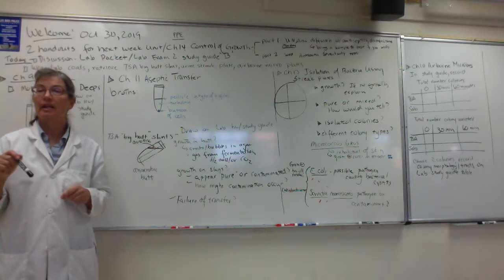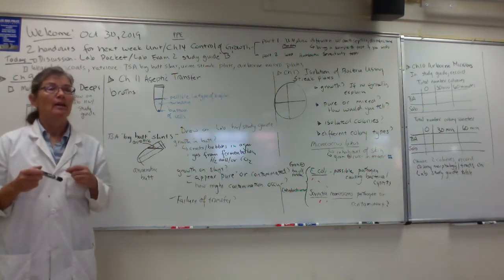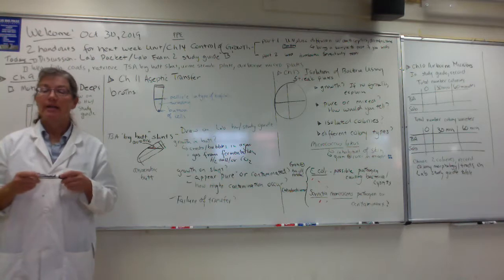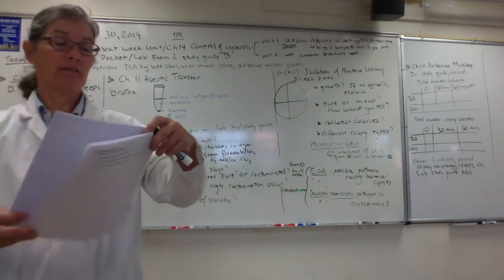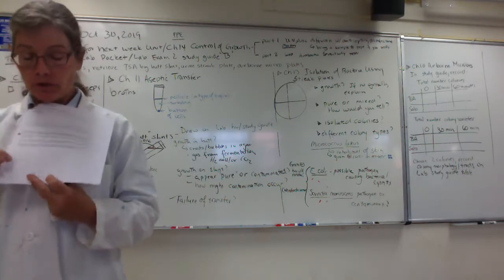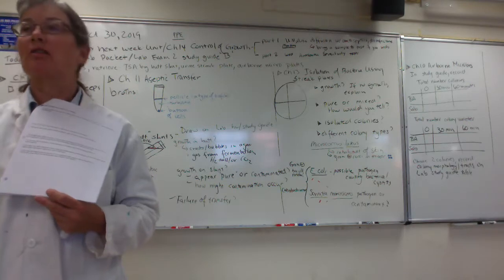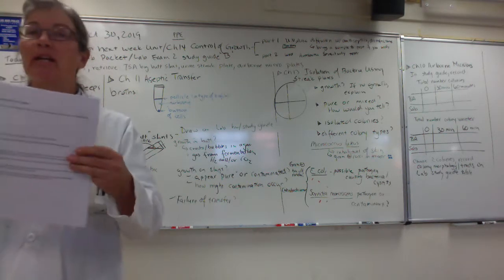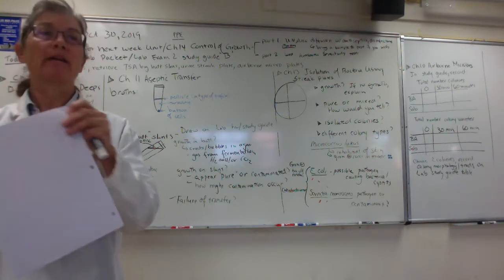Alrighty then. So you guys do make sure to include in your lab homework study guide packet a drawing of your butt slant, labeling growth on the slant, labeling growth, gas bubbles, cracks in the butt. Okay. And again, you can squeeze it in somewhere, and I apologize because I didn't leave you space for it. But if you want, you can do your diagrams at the bottom of a page, or what a lot of people like to do is just use a separate page to do their diagrams, and then they just staple it to the packet. And it's fine, you guys. You can just staple any additional pages to the back of the packet.